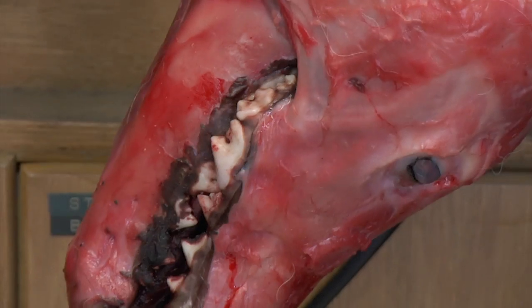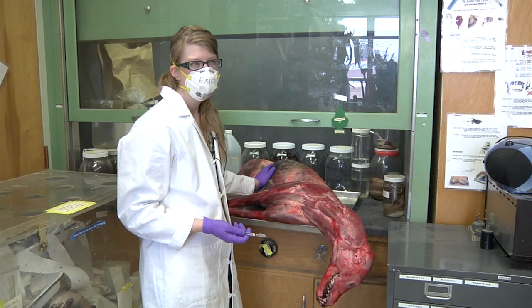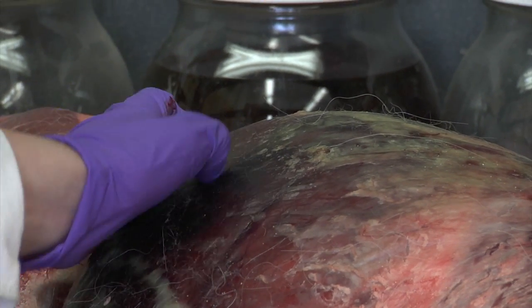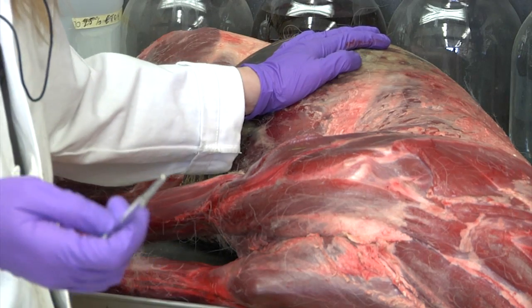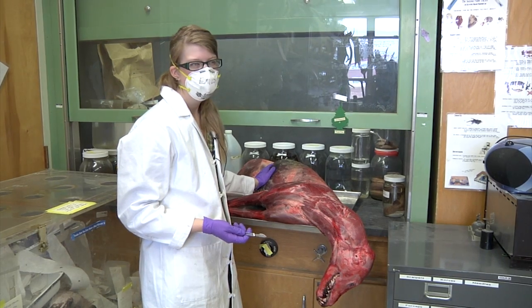This is day two of the wolf prep. This is the wolf that we got — it was hit by a car. The reason we moved him underneath the fume hood today is because he's got a little bit of gas in here. I got this scalpel and we're gonna try and release the gases today and hope that I don't vomit.